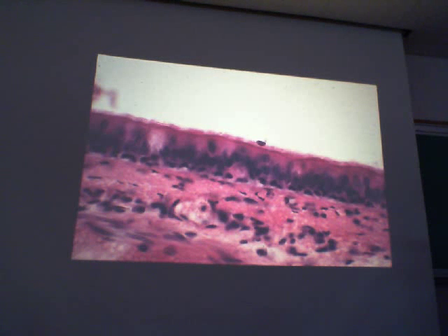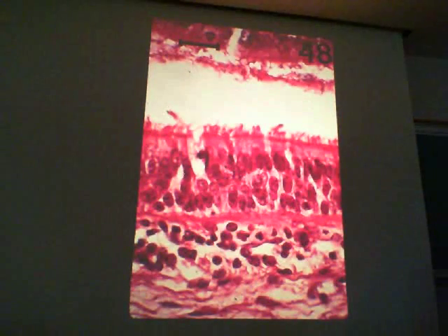And that layer that we see right there, what's composing that layer? Cilia. And 9+2, yeah. And then we have the basement membrane down here, and later on we'll be looking at the different layers in the trachea. This was taken from the trachea, and we've got a little bit of debris that's being transported by that ciliary escalator. Okay, and there's that basement membrane right there. Has some shrinkage in this particular slide that kind of accentuates that. That's that pseudostratified columnar epithelium.